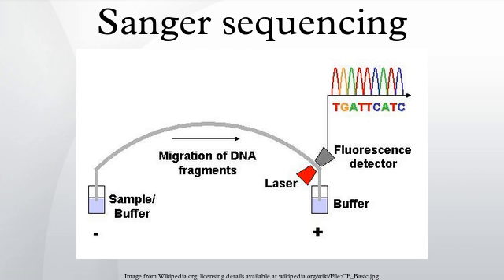Sequencing chemistry, thermal cycling. In the TC reaction chamber, terminator sequencing reagent, template DNA, and primers are loaded into the TC chamber and thermal cycled for 35 cycles. Purification. The charged reaction mixture is conducted through a capture purification chamber at 30 degrees Celsius via a 33 volts per centimeter electric field applied between capture outlet and inlet ports.